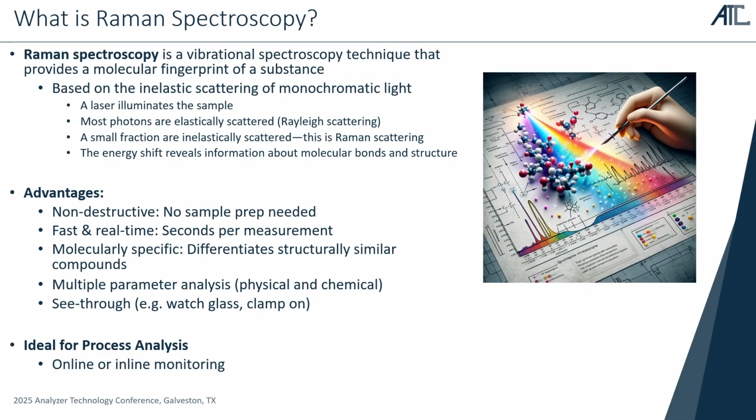So by shining laser light on your sample, we create a spectrum, and the spectrum can be analyzed in various ways like identification and quantification. This will be my examples later. So what are the advantages of the technology?